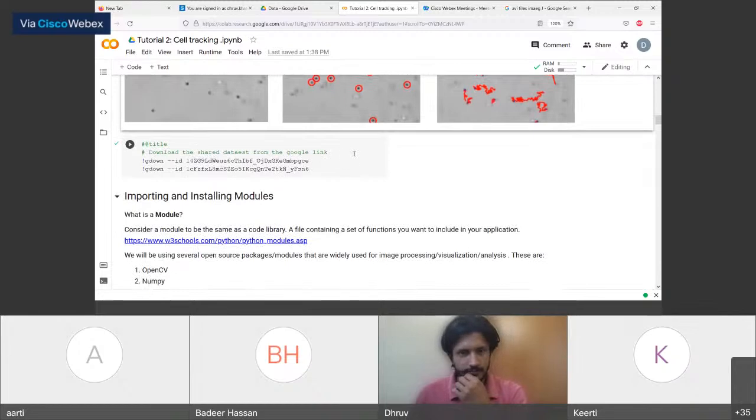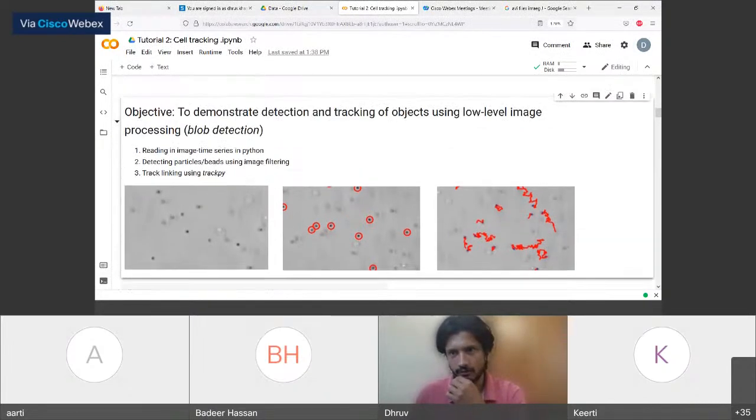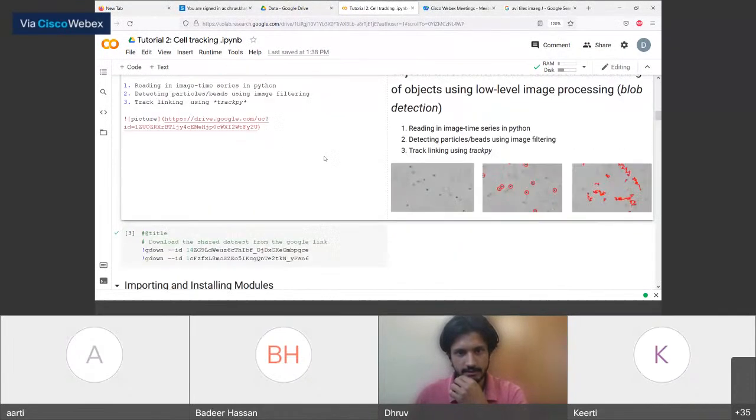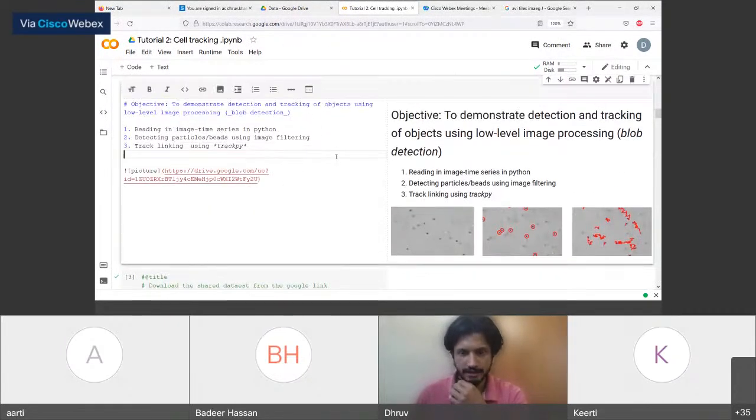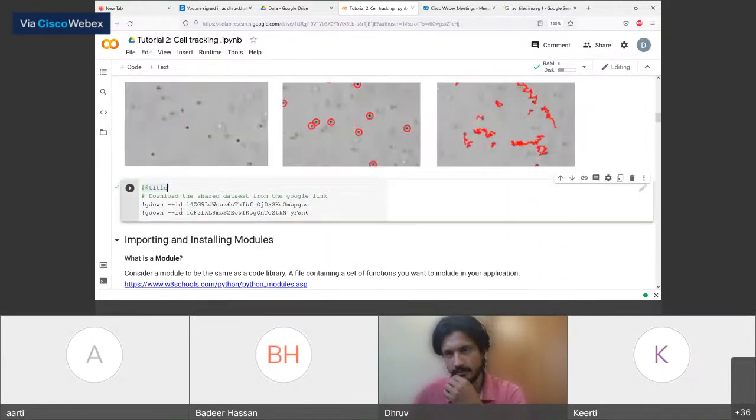So first, as for this Colaboratory framework, as Dr. Chaitanya discussed, there are two different types of cells here. One is this text section where I can add text, separate text, import pictures, and display them. And then we have this coding block where I can input different commands to download datasets.